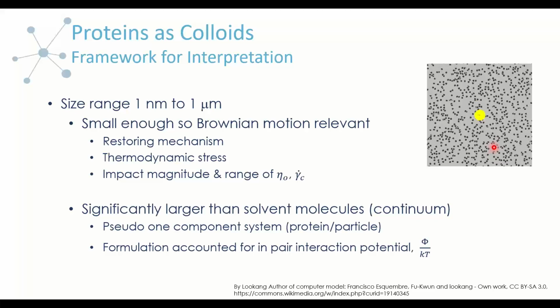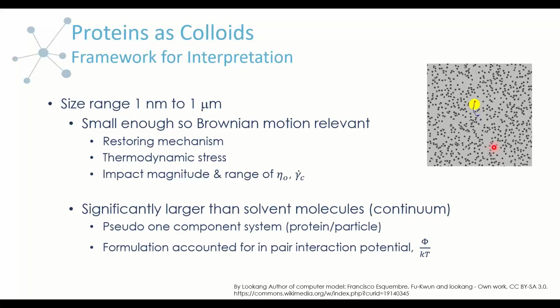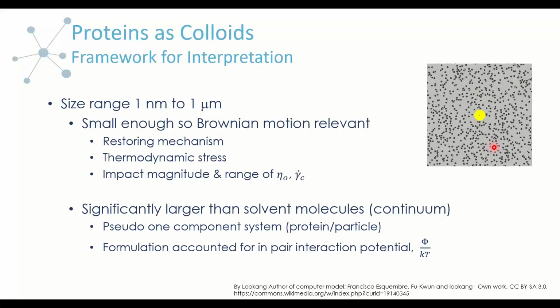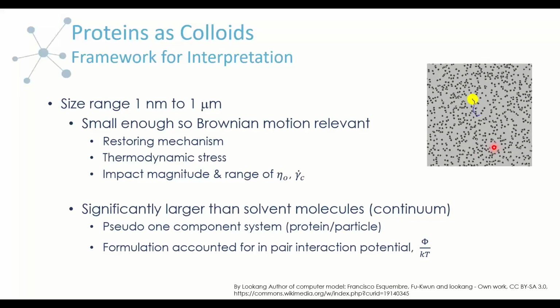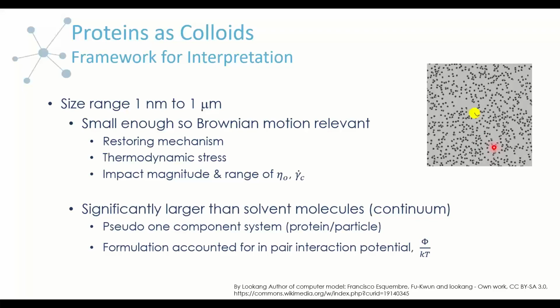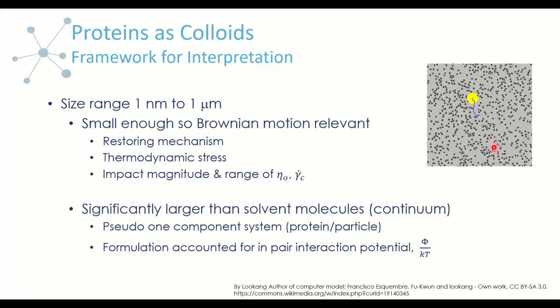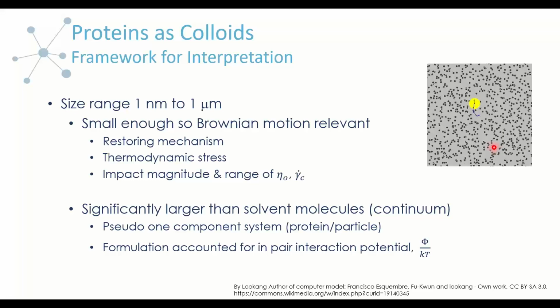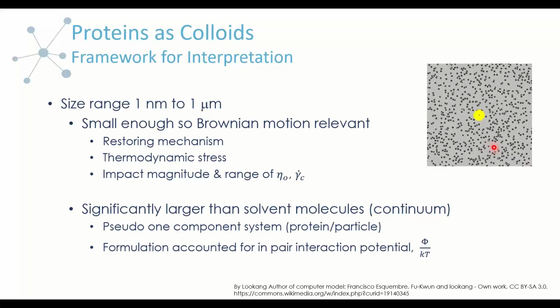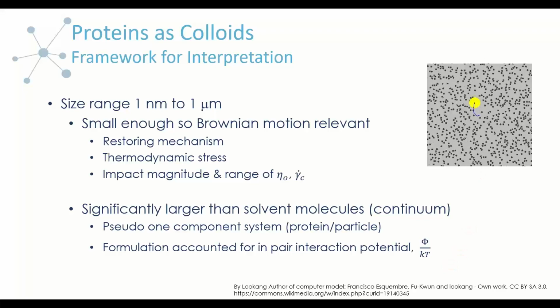And over time, given enough time, these proteins will interact and collide with each other and get stuck together and form clusters and exchange with free-floating proteins in solution. All sorts of interesting dynamic things happen in these solutions as they are stored. And this can cause changes within the fluid structure, which can then be reflected as a change in viscosity. And in many cases, especially with protein solutions, this can be reflected as an increase in viscosity.